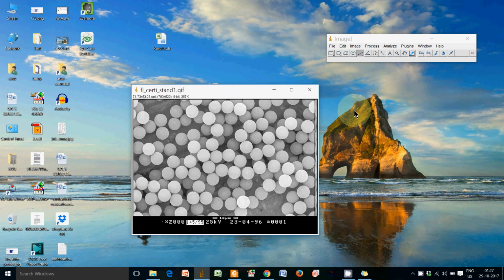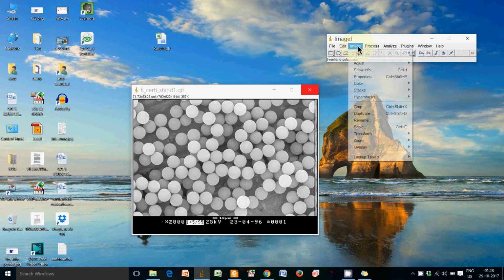Now, if you see carefully, you will observe that this is a SEM image where some particles are located at the top layer of the image and some particles are located at the below of the top layer. That means those particles are hidden and we don't want to select those particles for area measurement, because finally we will be taking an average area of all the particles. Therefore, what will happen when we will be doing it using thresholding, that I will show now.